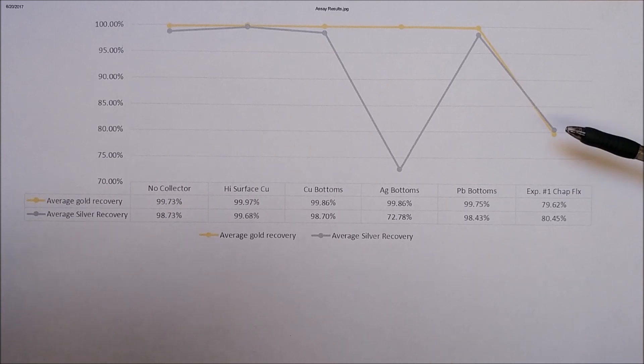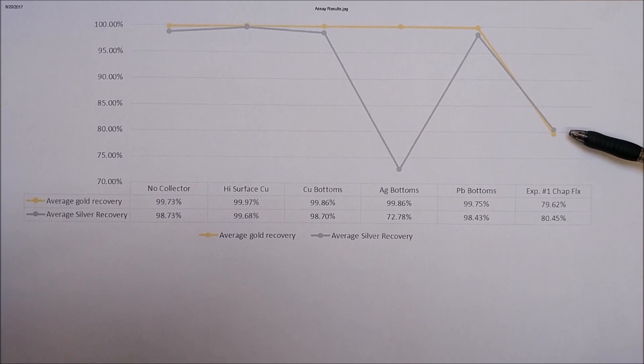And then this is the results from the Chapman flux, the one that I did kind of after the fact, just to see if we could oxidize away all of the metal and be left with a precious metal button. And as you can see, it didn't work very well. We only recovered about 80% of both the gold and silver. So this one proves that we do need a collector metal.